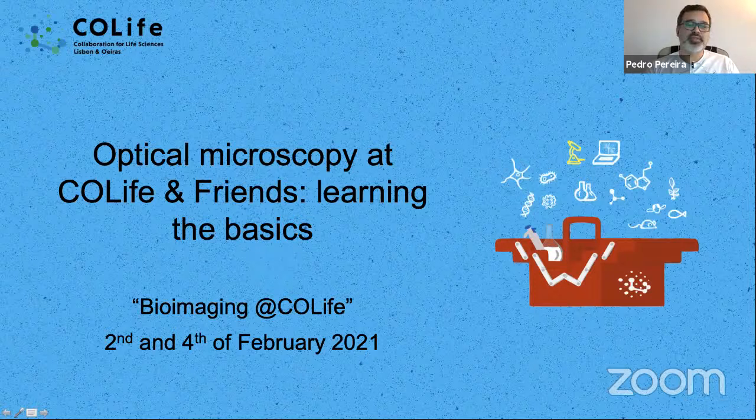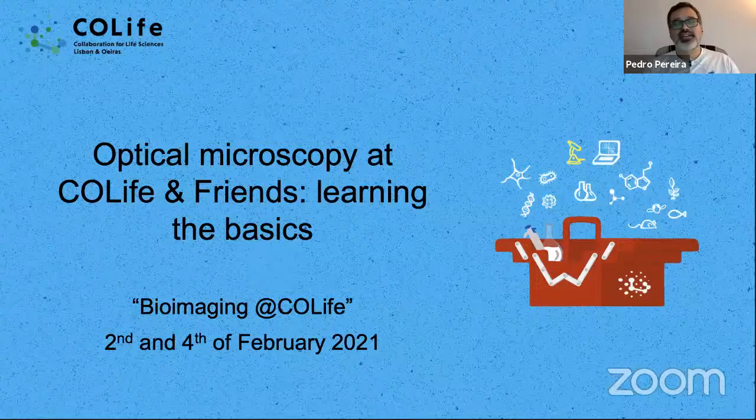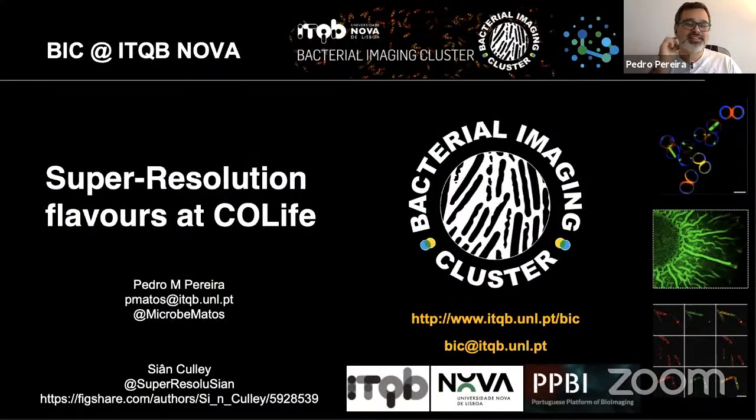Okay, so welcome to the second day of optical microscopy at COLife. And today I want to give you, exactly like the title suggests, a notion of the super resolution flavors you can find at COLife. I will take this opportunity to give you an introduction about the major super resolution techniques available, or at least the ones that resulted in a Nobel Prize. And I hope this is useful, not only because I know a lot of people are from outside of COLife. I hope this is useful for all other users.